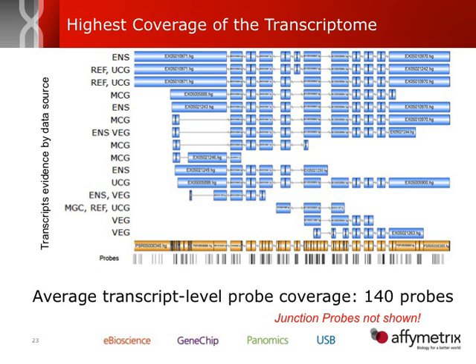So what does that all mean? This is a single gene. I don't remember which gene it is, but we can see that there are multiple isoforms known for this particular gene. That's what all of these blue transcripts represent. These are all the known isoforms. On the left-hand column is the data source that known isoform comes from.